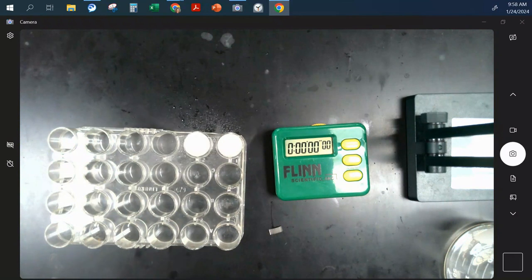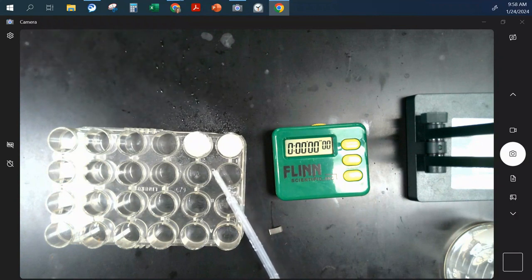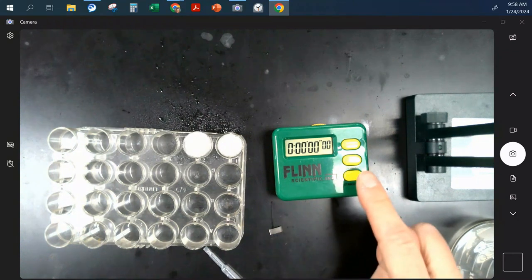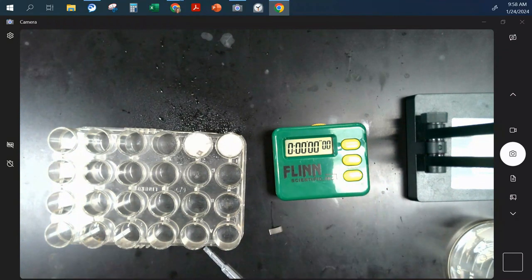So, okay, I can see the vapor coming off is mostly water, but sometimes some hydrochloric acid will also come out. So you need to not breathe that in. Okay, and we'll also turn our exhaust on. Okay, so I didn't start my timer. I should have done that, but you should be able to measure that.